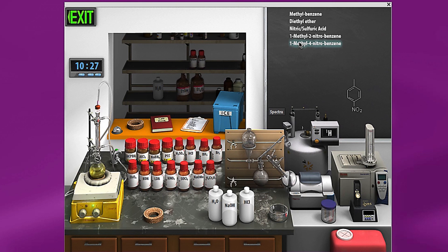I'm going to continue my reaction until it's complete. You will actually also get the product that has nitro groups at both spots, the ortho and the para. I'll advance the time. Okay, so now my methylbenzene has been consumed. You can see on the whiteboard that I have 1-methyl-2,4-dinitrobenzene, which as I said is the di-substituted form.